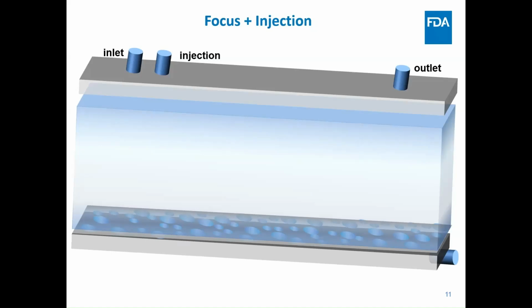But in traditional column chromatography, the sample separation starts as soon as the sample enters the column. But in AF4, there's a unique step called the focus, injection, and relaxation step. This is quite different from column chromatography. Let's take a look at how this step works.